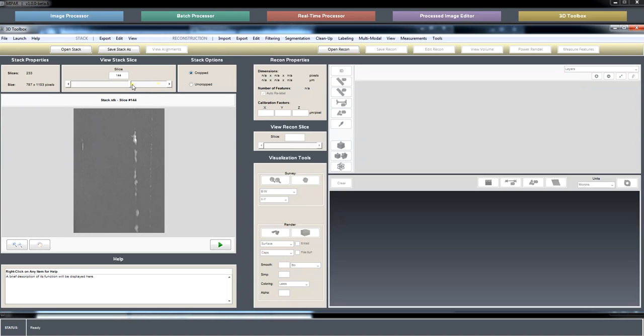If you want to refine the alignment further, which we might need to, because there's a little bit of dancing up and down. I know I said you want to avoid using these features for their own alignment, but it looks like they're perpendicular to the imaging plane anyway.